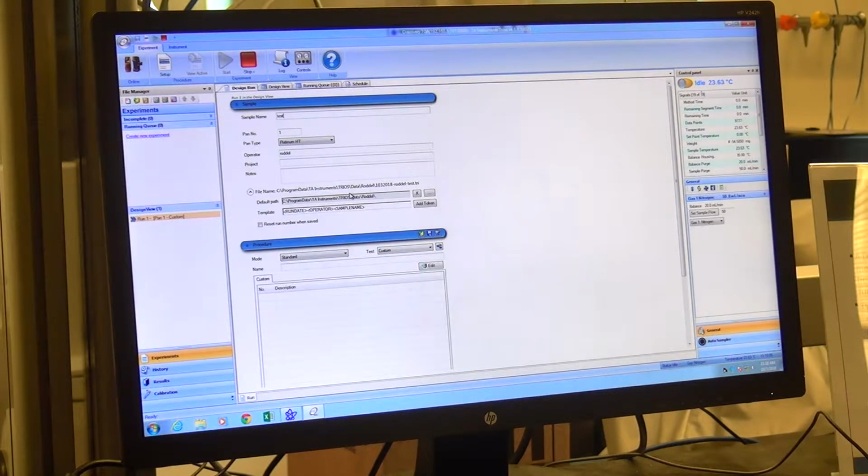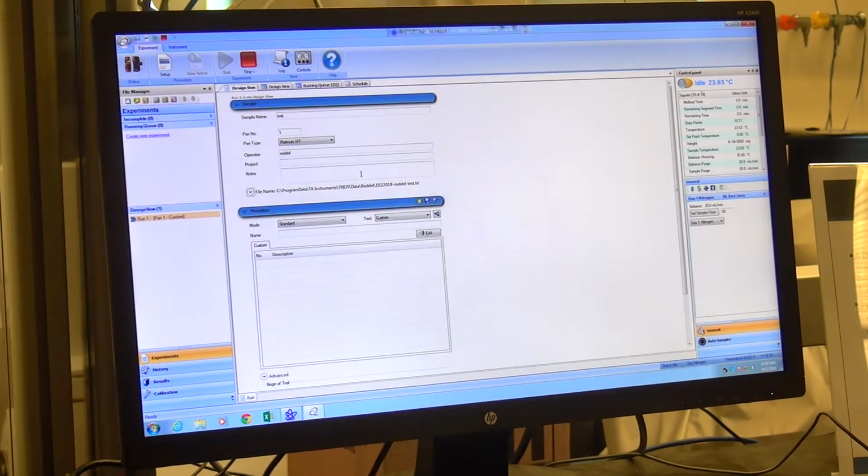Especially if it's in the same folder, it will identify that there's another file with the exact same name in there, and it will just add a 1 or 2 next to it to make sure that it doesn't overwrite it by accident. Now, if you accidentally put it in a different folder, it won't see it. So be careful with that one. Make sure you're in the right folder before you start messing around with your file names and things like that. Once that's finished, you're basically finished with this entire top section.